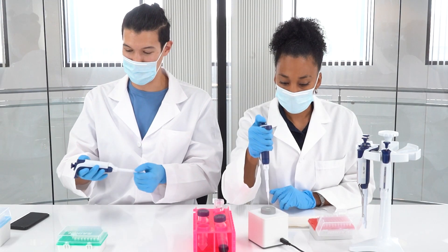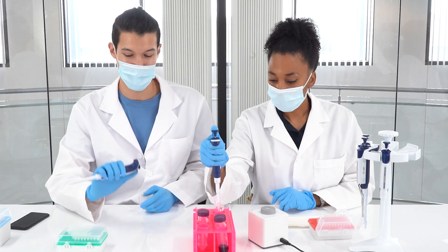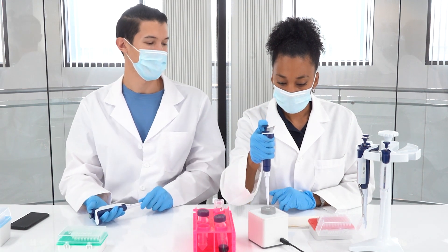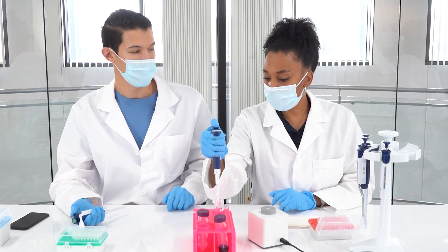Look at this fresh new 200 microliter pipette — I can even accurately pipette 20 microliters on this. What are you doing? I'm using Smart Check to test my pipette and also testing my technique.